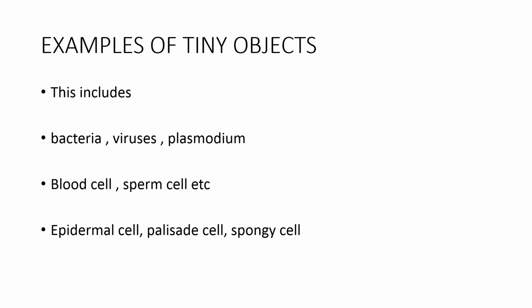They are tiny little objects that cannot be seen with the use of the eye, and therefore we use the microscope in viewing these tiny objects.